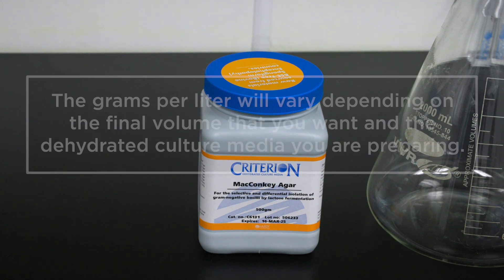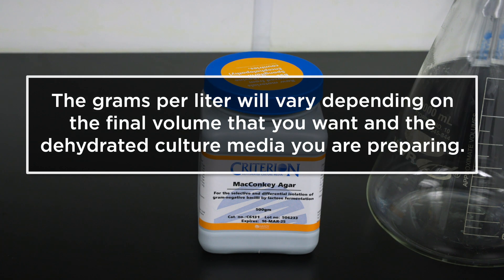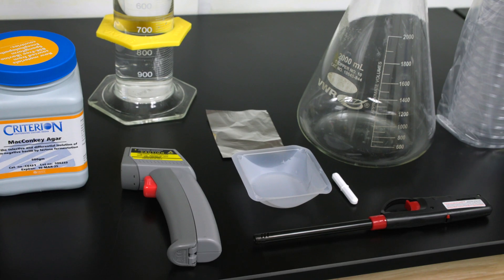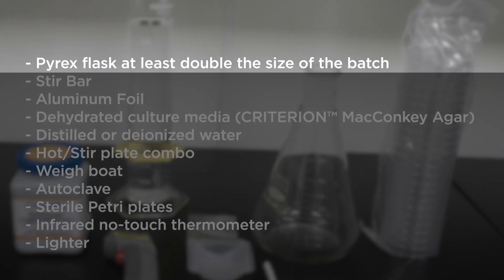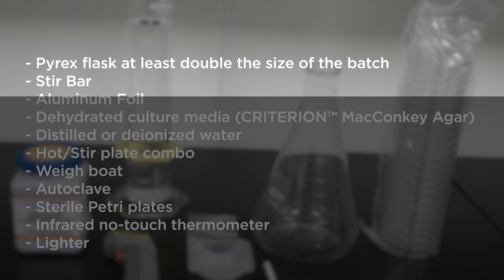The grams per liter will vary depending on the final volume you want and the dehydrated culture media you are preparing. In order to make a batch of prepared media you will need a pyrex flask at least double the size of the batch, a stir bar, and aluminum foil.